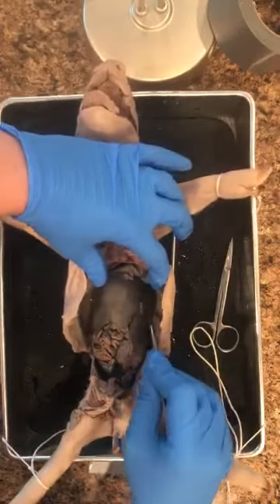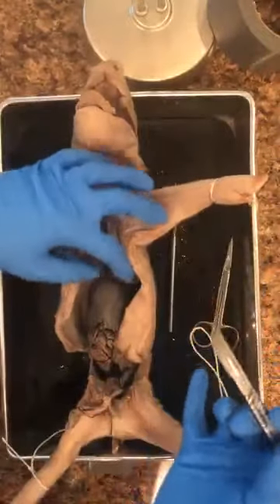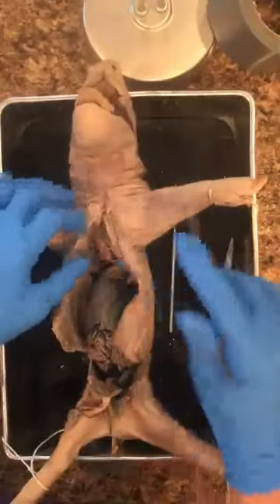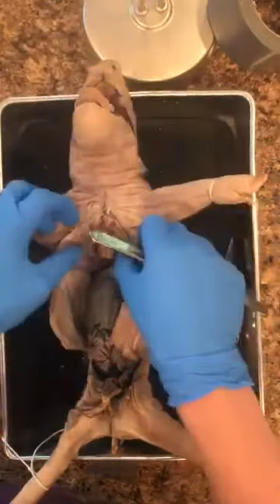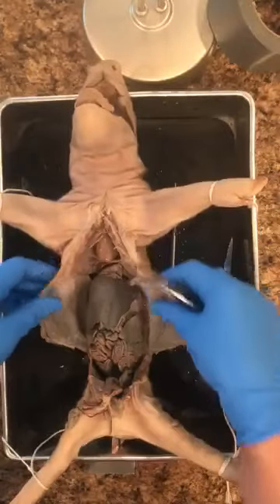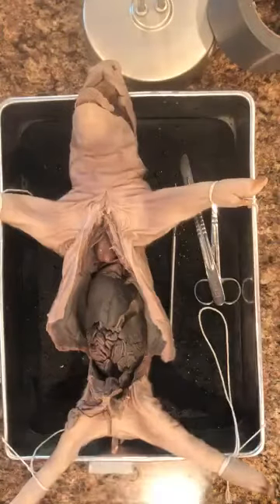But as I'm cutting it, you should be able to see more and more of the lungs, which are down here, and the heart. So this thing right here, here's the heart. Okay. Oh, no, I'm ripping it. There we go. Oh, that's a beaut. That's not even filled with too much juicy gunk. Maybe I can just use a paper towel and pat it dry so we can move on here.